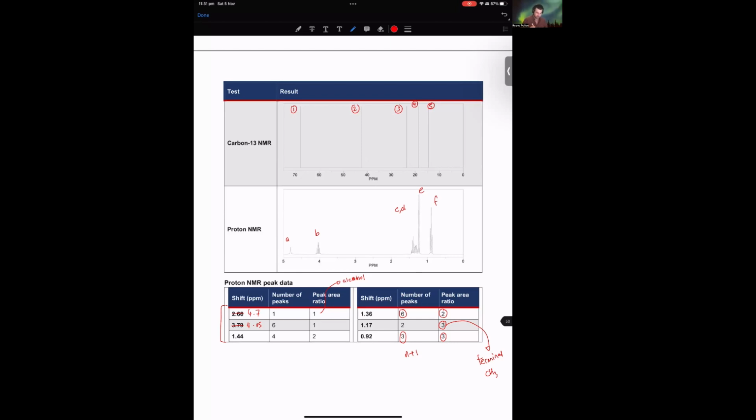Moving on to our next option, we then have a peak area ratio of 2. Okay, so there are 2 protons. Again, that's suggesting to me a CH2, but this time we only have a multiplicity of 4. So we're seeing a quartet. Now, if we're building up our chain as we go, so far we've covered the CH3, the CH2, the CH2, and then this particular environment only has a quartet. 2 of those protons are accounted for. So by the n+1 rule, there's 1 more proton missing, which must be next to it.